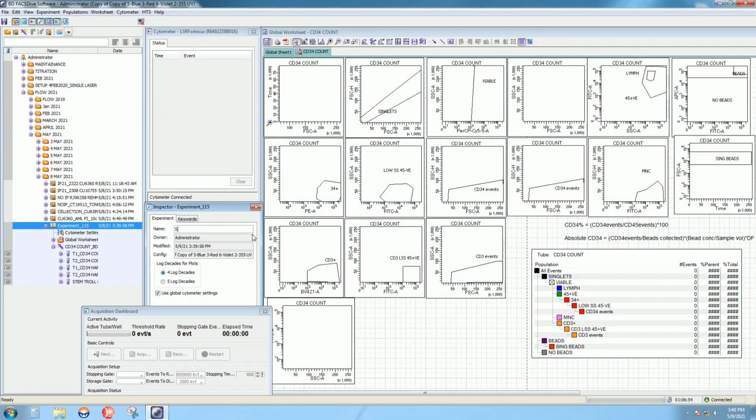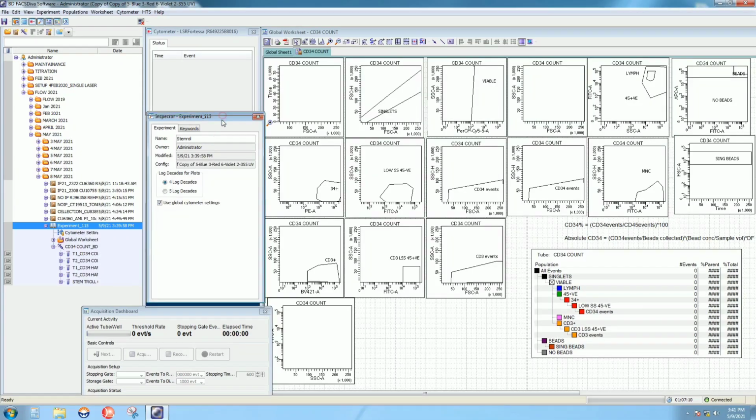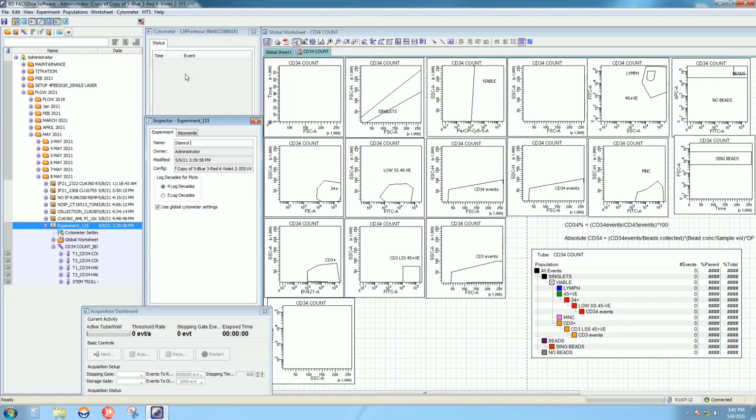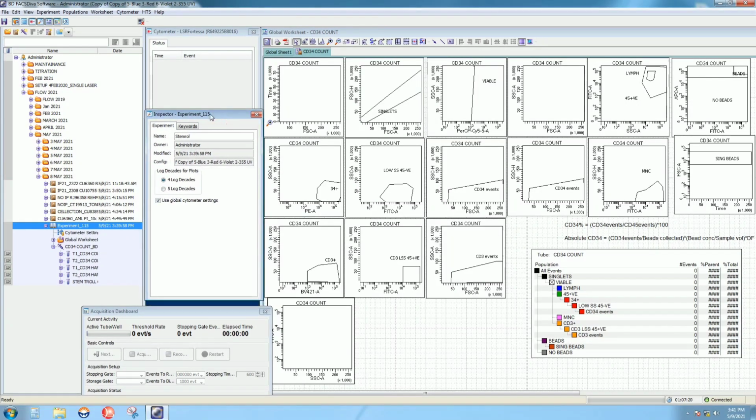Label the assay; either it can be a Stemtrol or the patient sample which has been received from the BMT. Samples are of two types: it can be a pre-PBSC or a harvest. For pre-PBSC we use the direct sample if the count is less than 40,000 per microliter, and for harvest we have to dilute accordingly to match your kit. So we have labeled this specimen as well as our experiment.